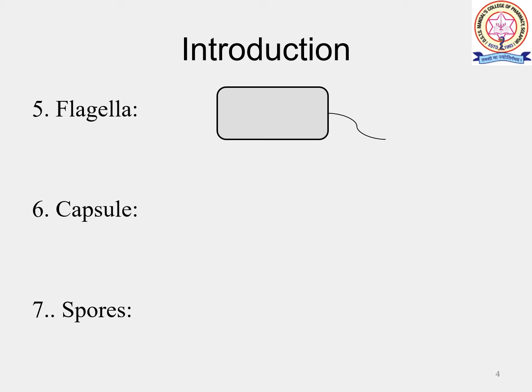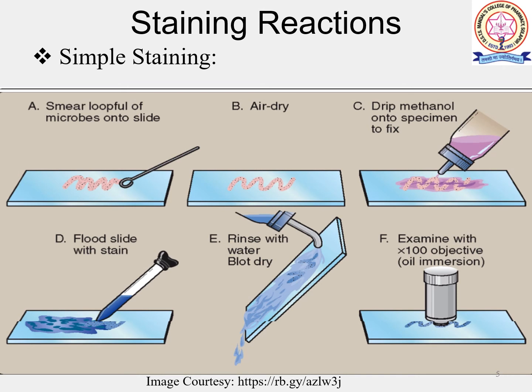They may be of the same width or wider than the bacillary body. Spores may be equatorial, subterminal or terminal. Now these are some bacterial characteristics, and depending upon these characteristics we are going to identify the different types of bacteria. Now we will move towards simple staining.